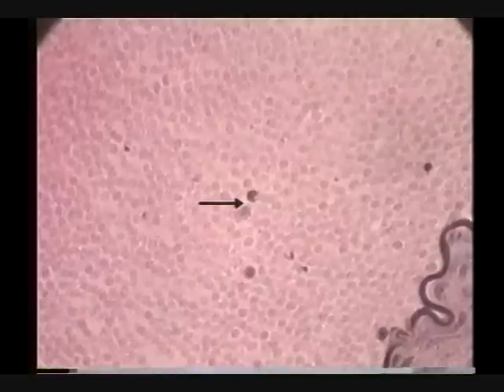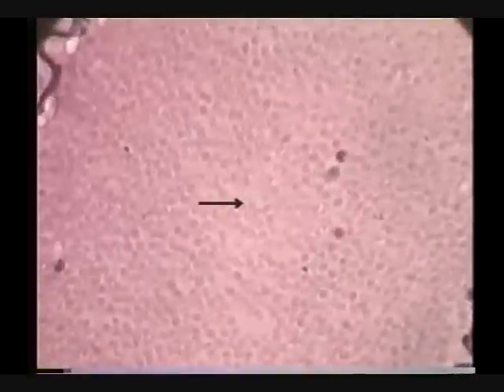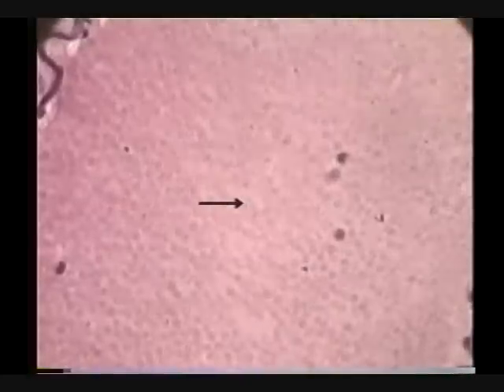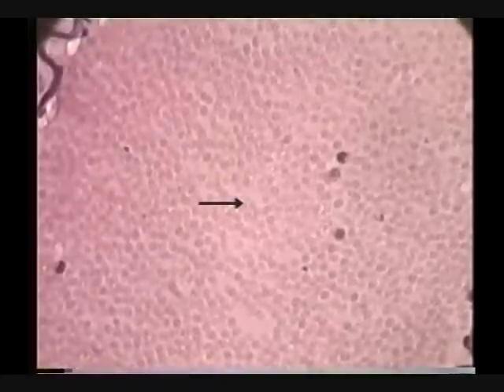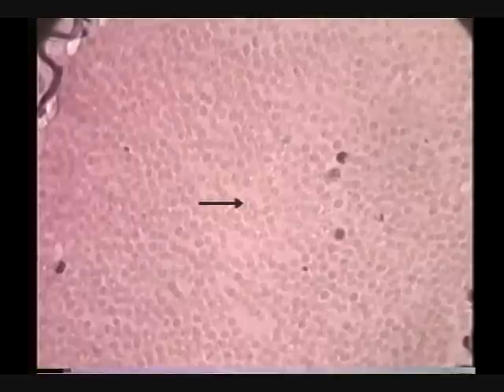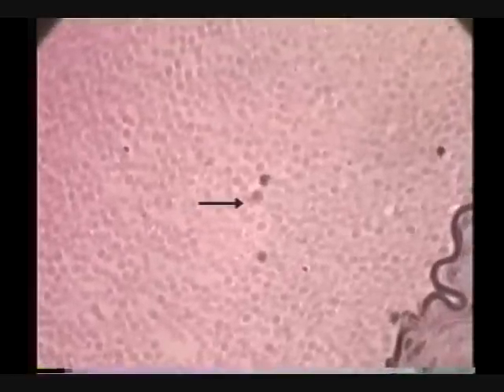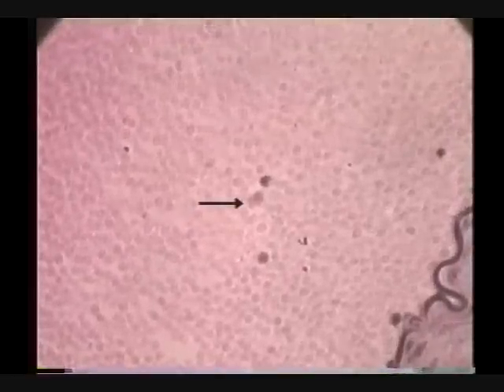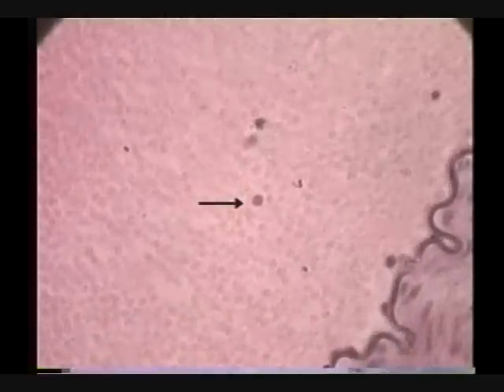Leukocytes. And then all of these other objects are red blood cells. And you notice they don't have nuclei, so they show up paler than the white cells. White cells, because of the nucleus, show up very distinct.